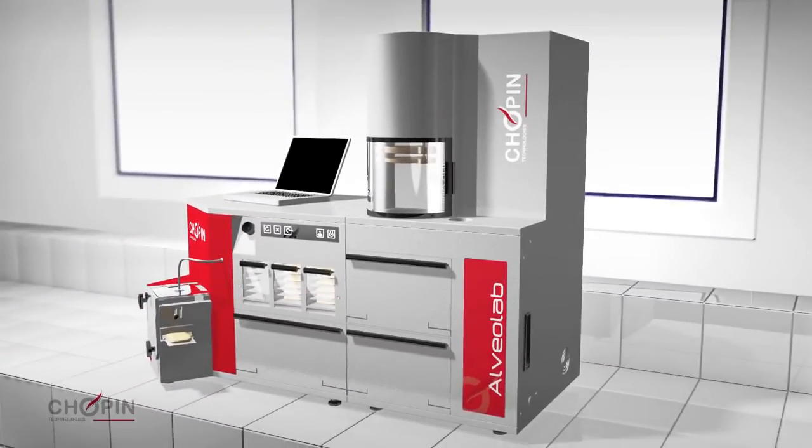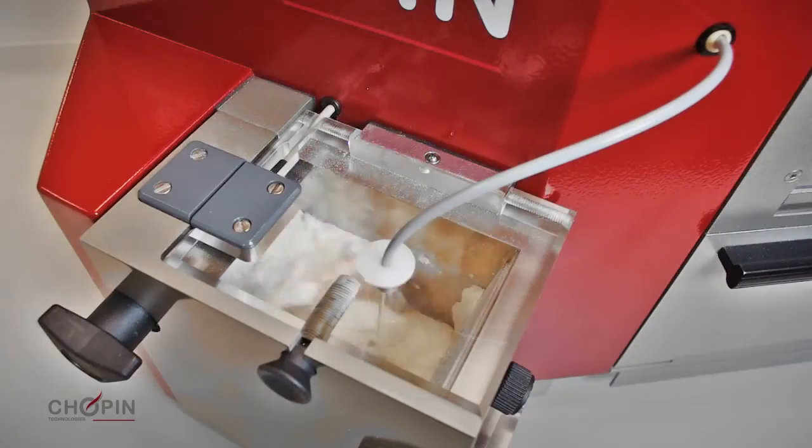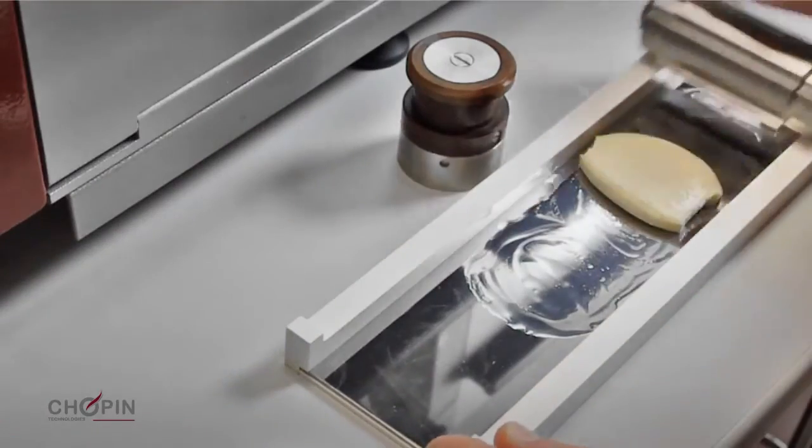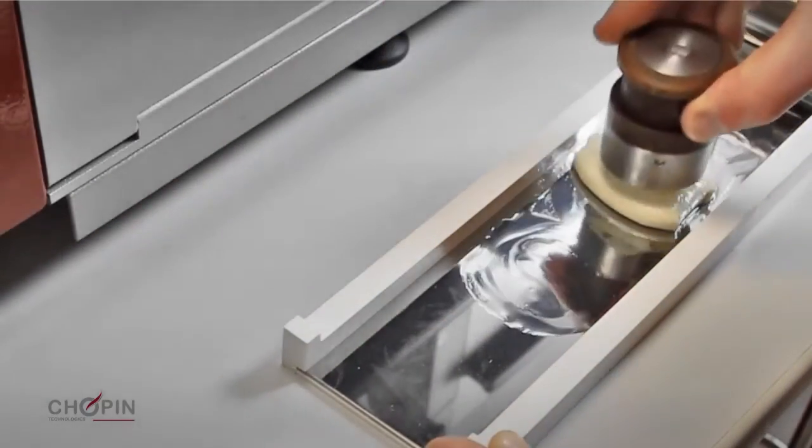Some examples of these innovations are automatic pump calibration, automatic water injection, and new accessories such as resting plates and a dough cutter to better control the preparation of dough pieces.